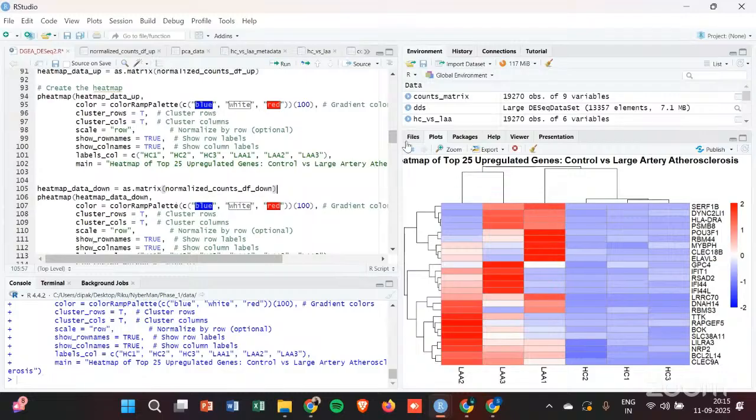According to the calculations done internally by pheatmap, since I have put cluster_rows equal to TRUE, and cluster_cols equal to TRUE, which is the default, basically I have only just shown it to you. This performs a hierarchical clustering on your data.